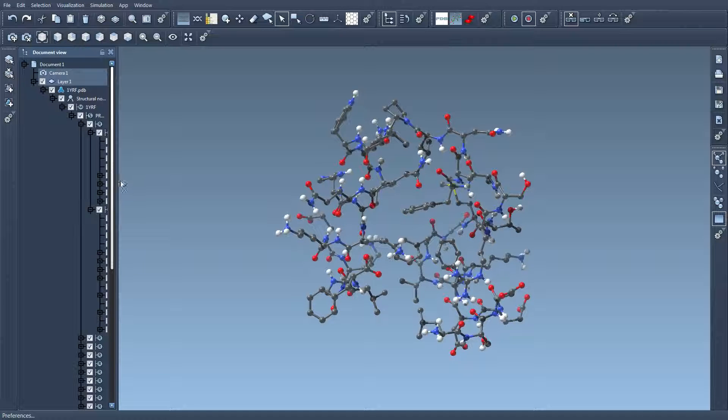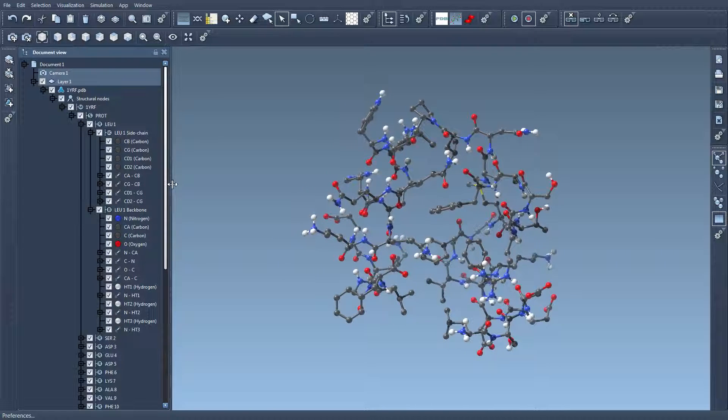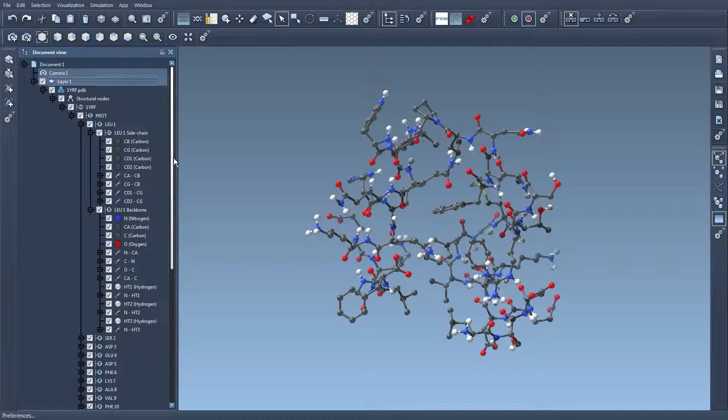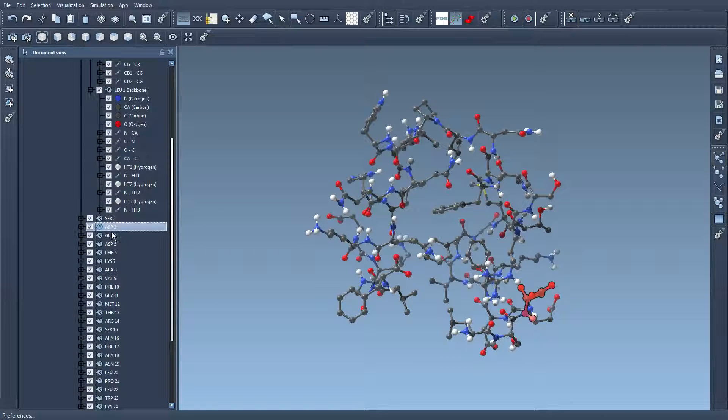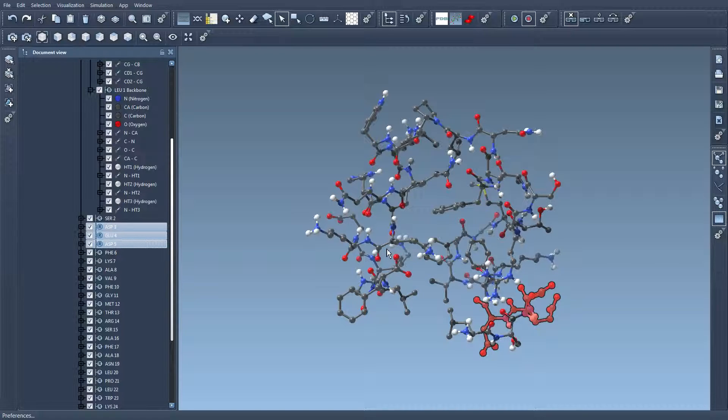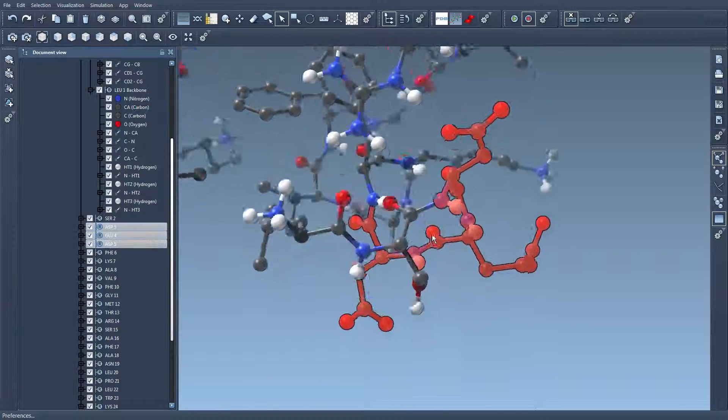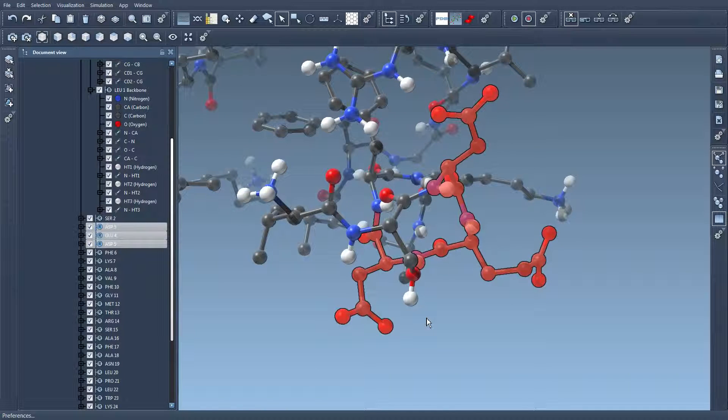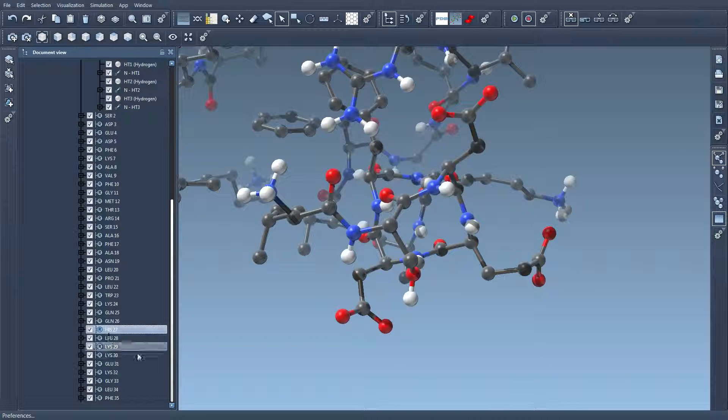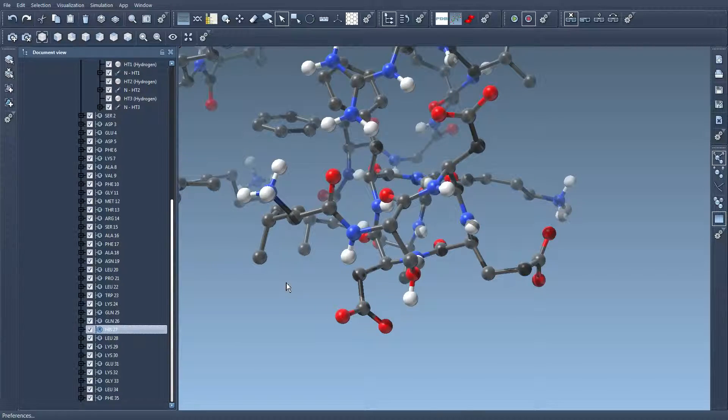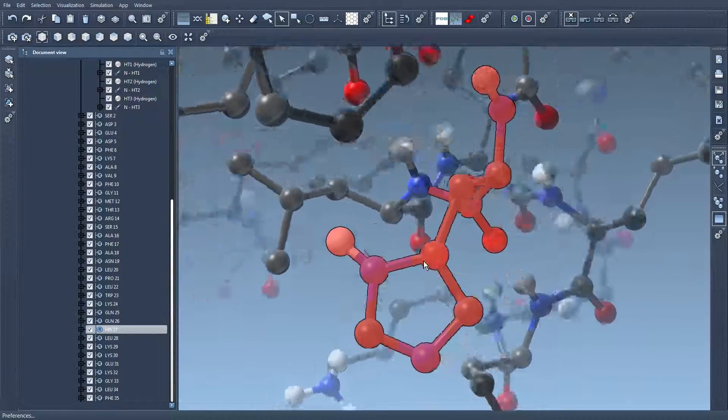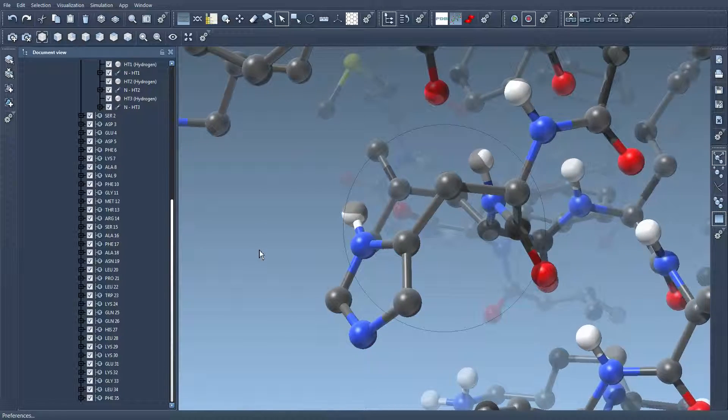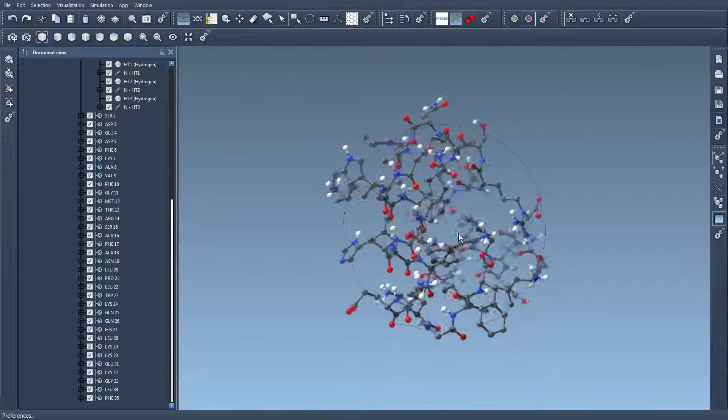Now the thing is that shift space centers the camera on the selected parts. So if I select these three amino acids for example, when I press shift space the camera is centered on these amino acids. I could select this one, I don't know where it is yet but I press shift space and the camera moves to this selection. If nothing is selected then the camera is centered on the full view.